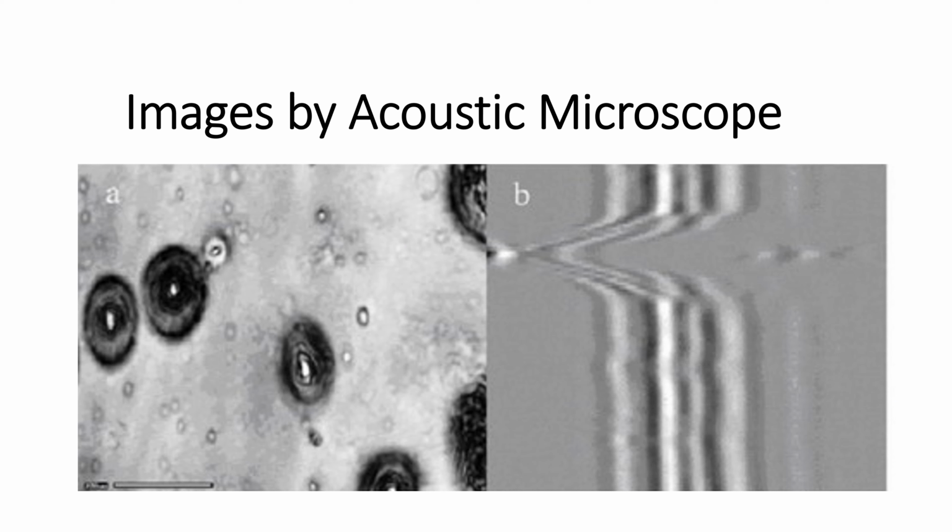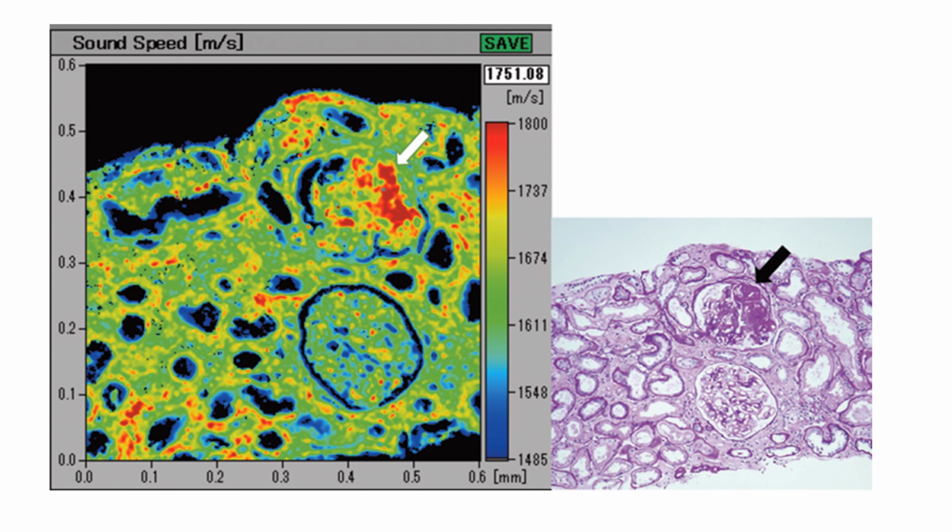Here are some examples of images produced by acoustic microscope. Use of acoustic microscope in pathology lab.